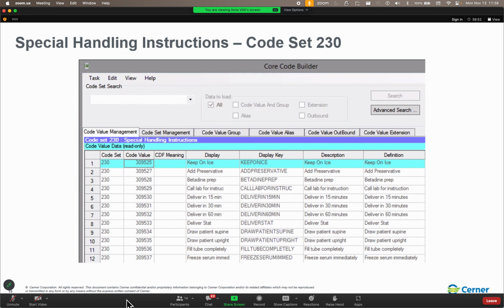But you know what? It's been years since we have had that many accession numbers generated. So somebody is going to have the brilliant idea, well, can we go ahead and reduce that back down to 4? My answer to you is no. Just because you can, the tool will let you, doesn't mean you should.